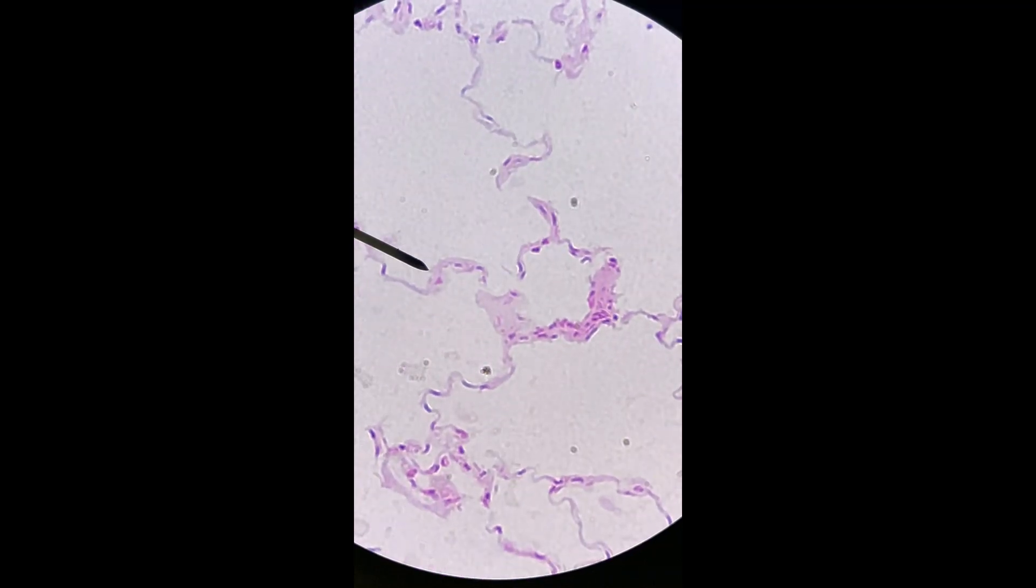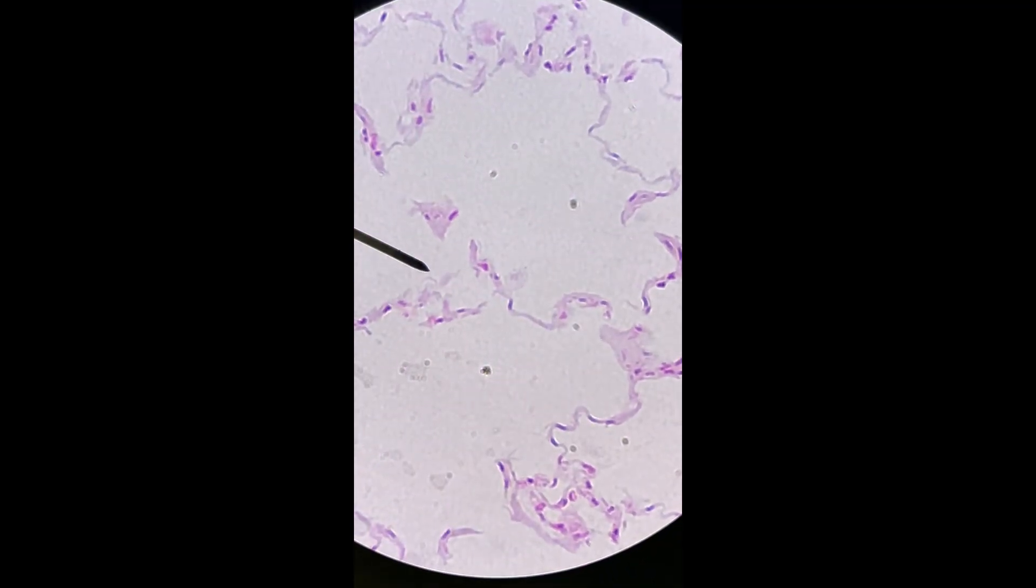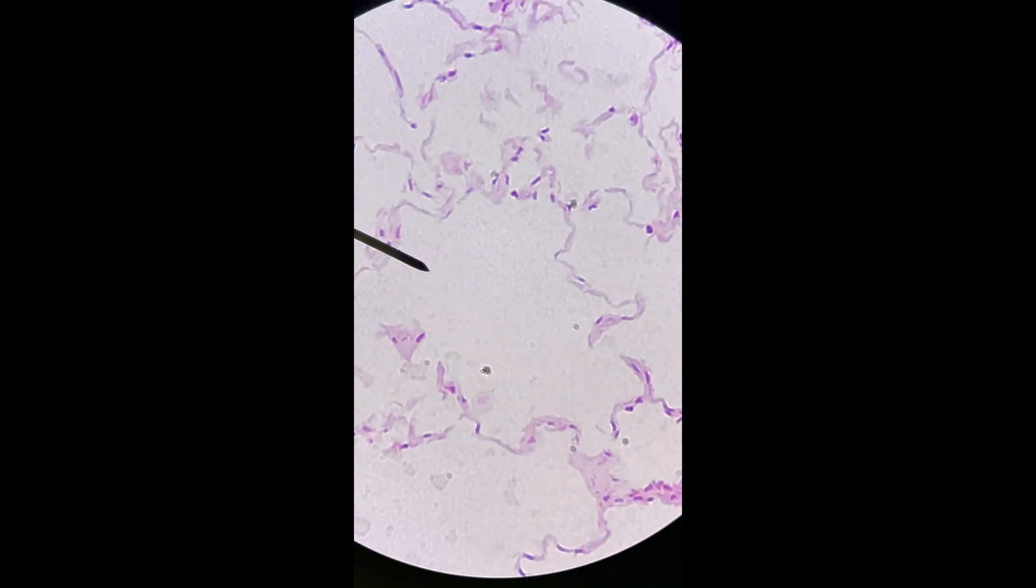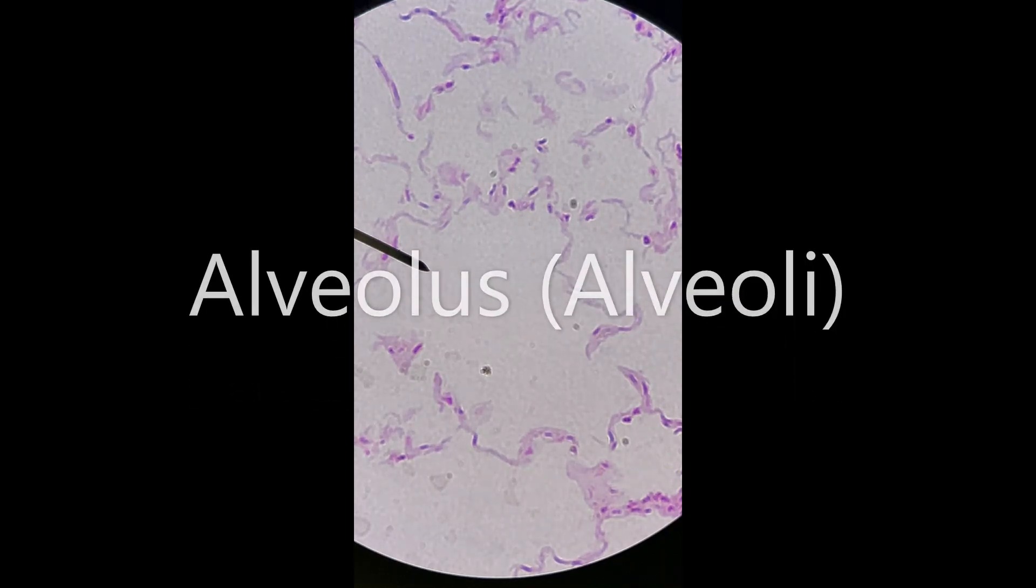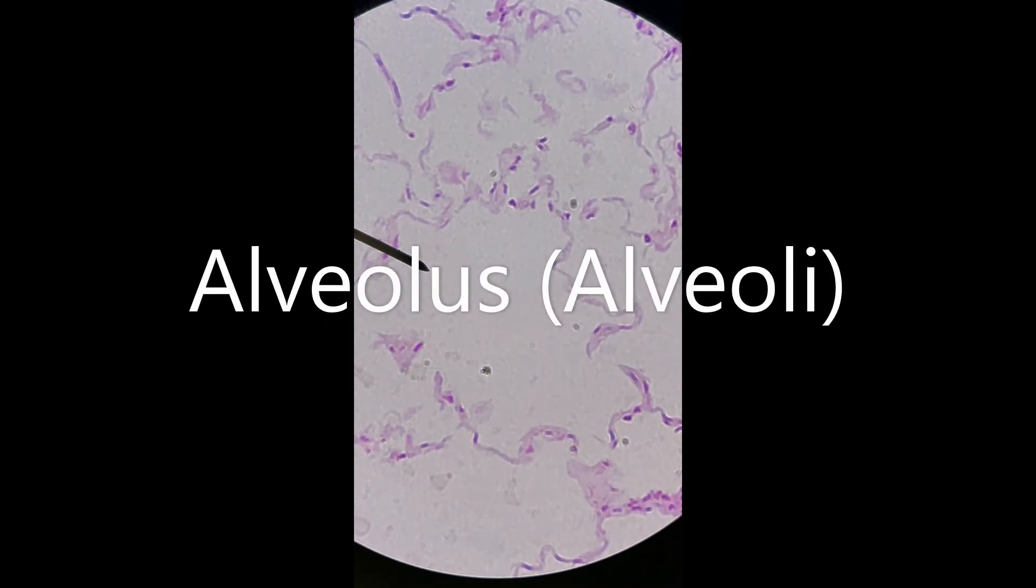So if I kind of pan around here, you can see these are little sacs. So this open space right here that the pointer's in is basically the lumen of an alveolus. So singular is alveolus, plural is alveoli.